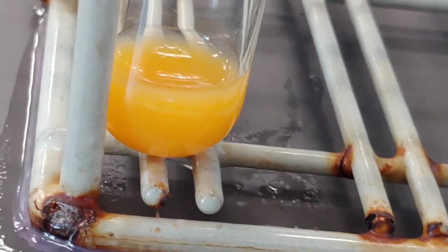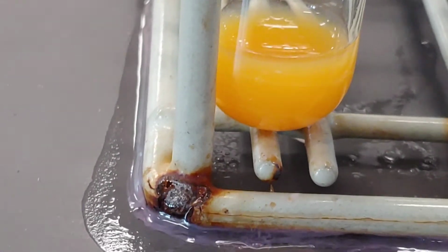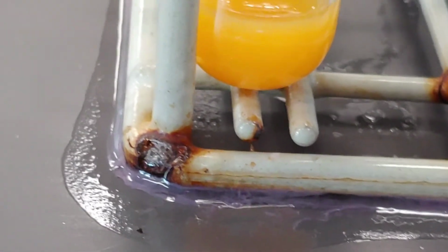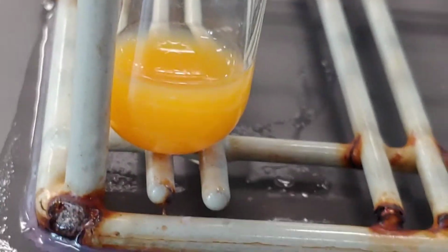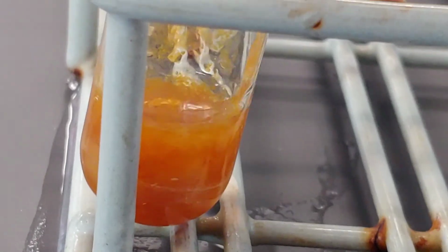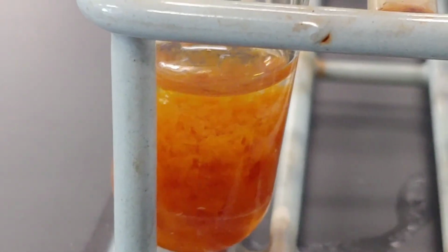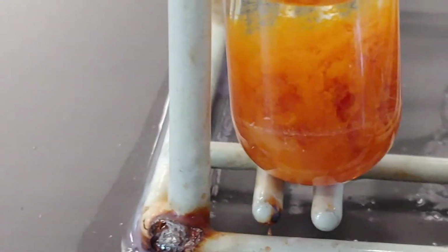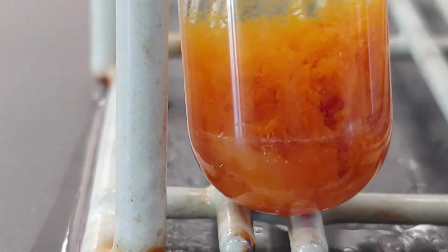Okay, now we're on reaction number 14. This is aqueous iron 3 chloride. And to that, I'm going to add aqueous ammonium hydroxide. Ooh. Did you see that? Ugh. All right, that's my official comment. Ugh. All right, well that's it.